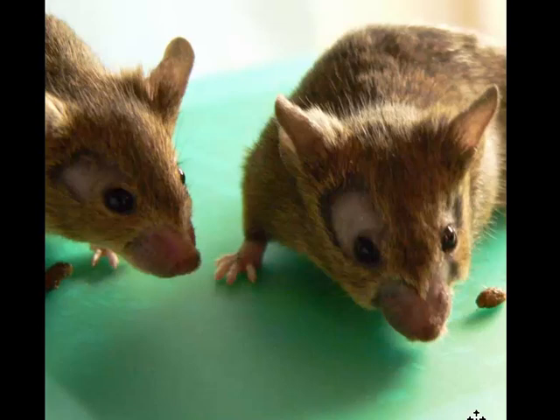So this was a very dominant female mouse who found the exact way, and it's a pretty easy fix to figure out exactly which mouse is doing it, because that's the one that's not barbered at all. So take that mouse out, put it in another cage by itself, and see if the hair does not grow back. The same thing with fighting.